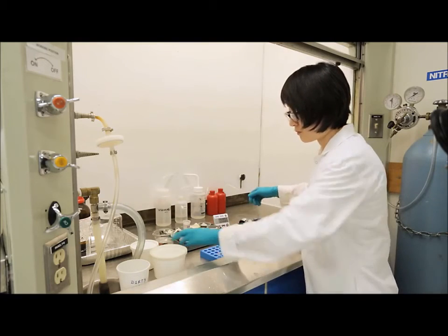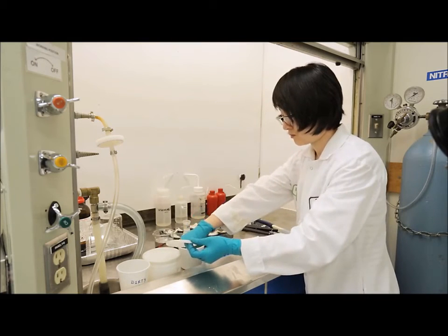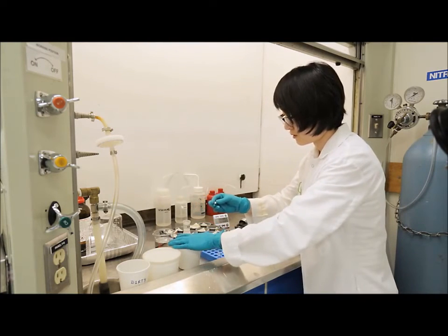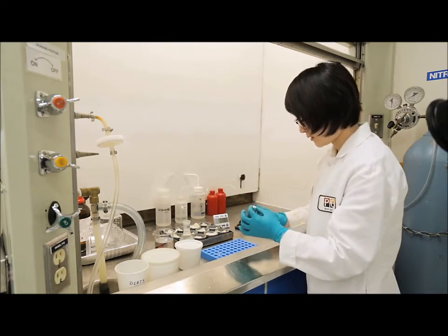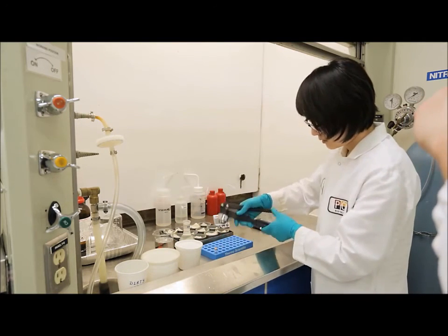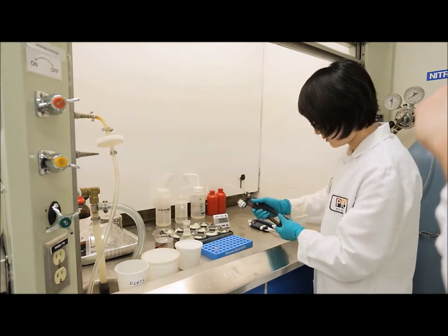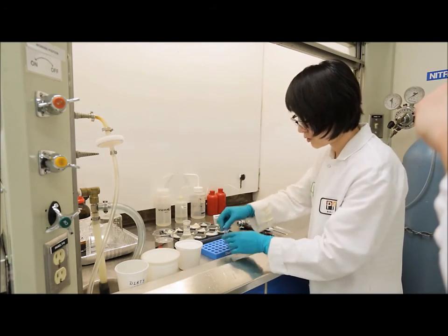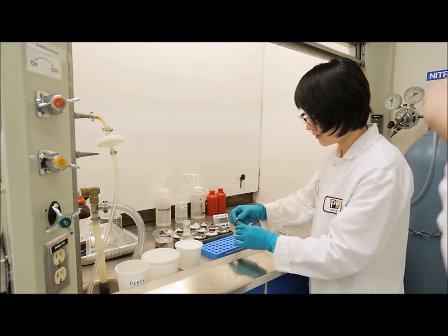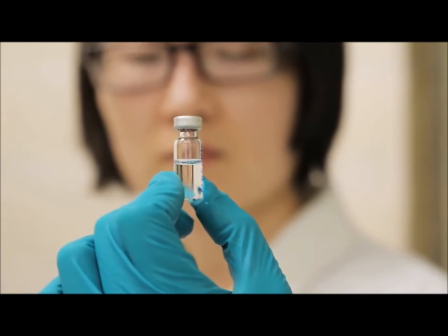And after the heptane has been added, we can cap the GC vial. It is important to ensure that the cap is on secure and it's not loose, to prevent any of the heptane from evaporating. The sample is now ready to be injected onto the GC.